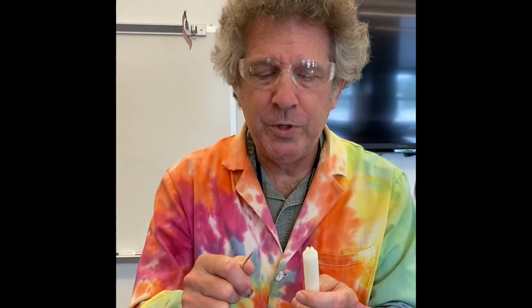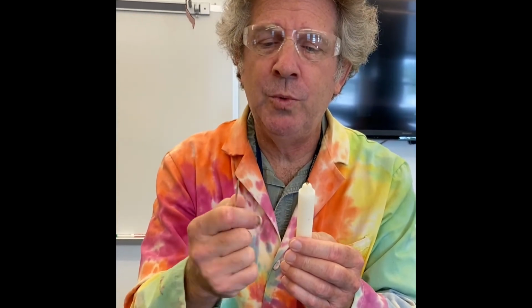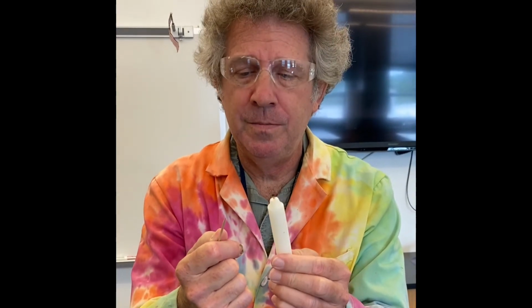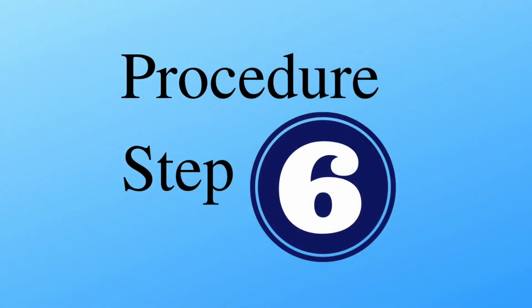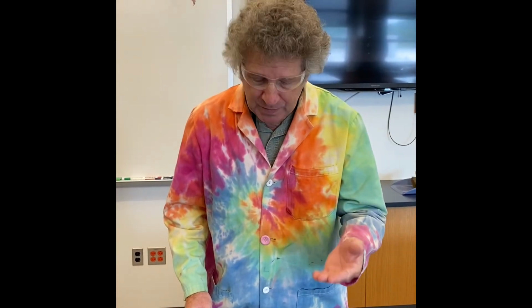Why couldn't wood be used as a wick? Why would this not make a good wick, wood as opposed to string? Okay, so we don't think wood makes a good wick. We believe we want it to be made out of string.